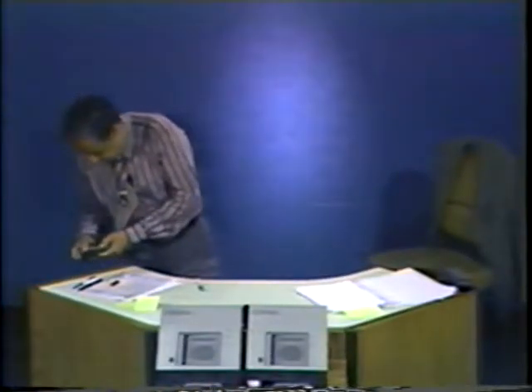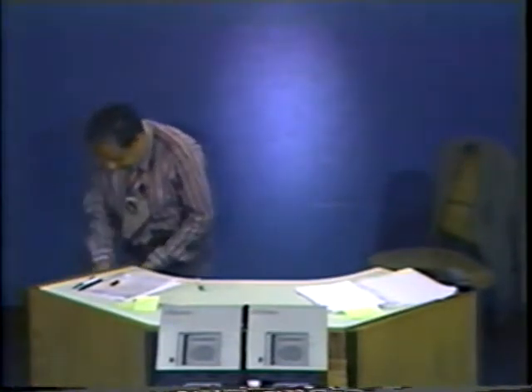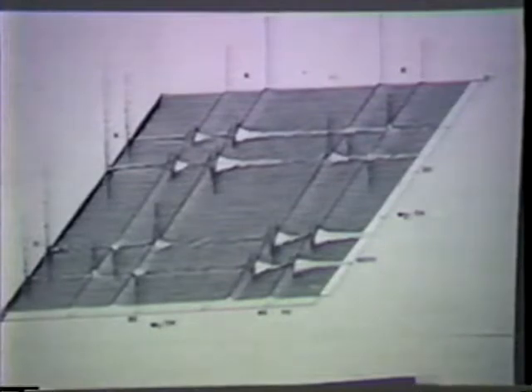The ridges you see are just artifacts, experimental. Let me go back. Can we have the slide again on the next one? Okay. Oh yes, the ridges are the experimental. These are tails. As we saw even in the calculated spectrum, these come from the dispersive components of the Lorentzian. And they are the greatest nuisance that we have, and that's the reason one has to use very strong filtering in these experiments, which kills the signal to noise quite a bit.